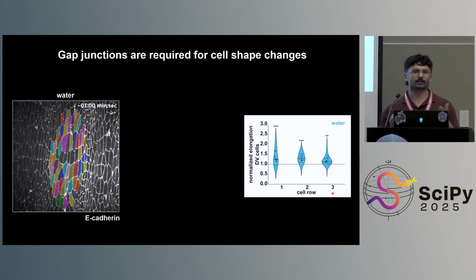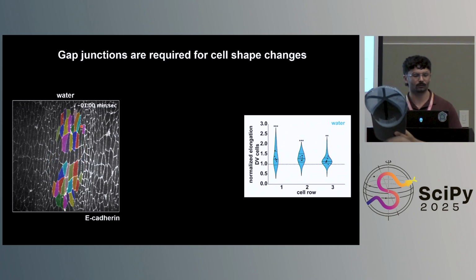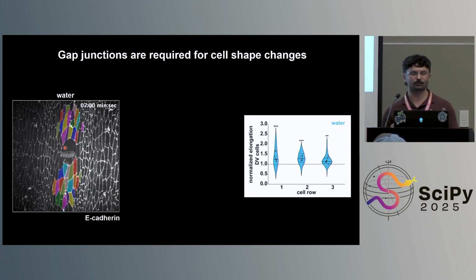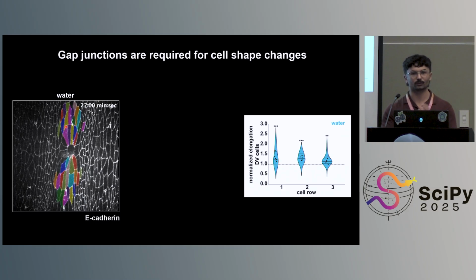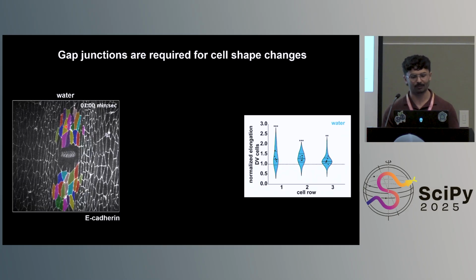Now, what's happening to those more distant cells? Well, I used ReSCU-Nets to segment out the cells around the wounds under this treatment. And what we notice, first of all, in controls, is that these cells that are positioned dorsoventral to the wound, or at the top and bottom of the wound in this video, begin elongated towards the wound direction. And then as wound healing progresses, they actually elongate even more dramatically to sort of cover over that tissue gap.